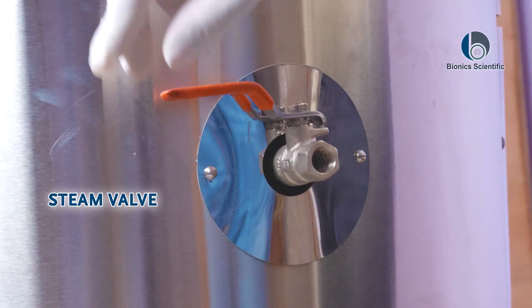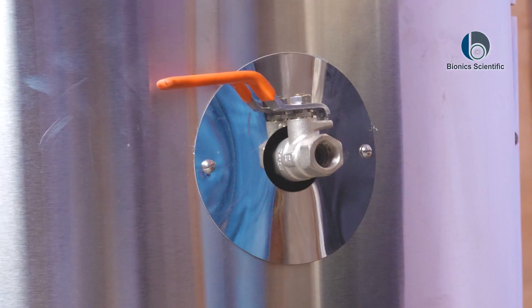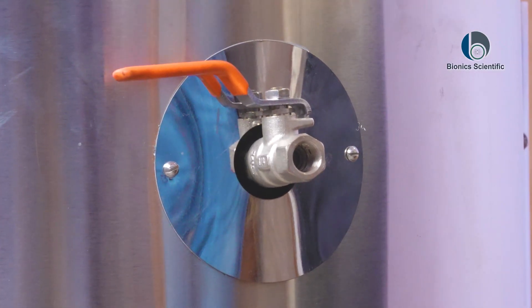There is another valve present above the autoclave — this valve is for steam release purposes. Since the machine is currently not in working condition, I cannot demonstrate it right now, but I will show it in a further video.